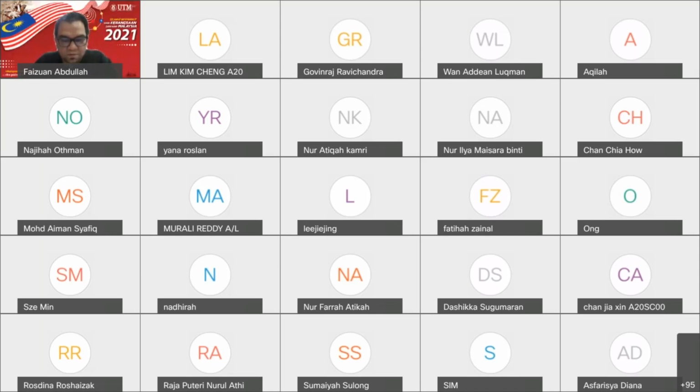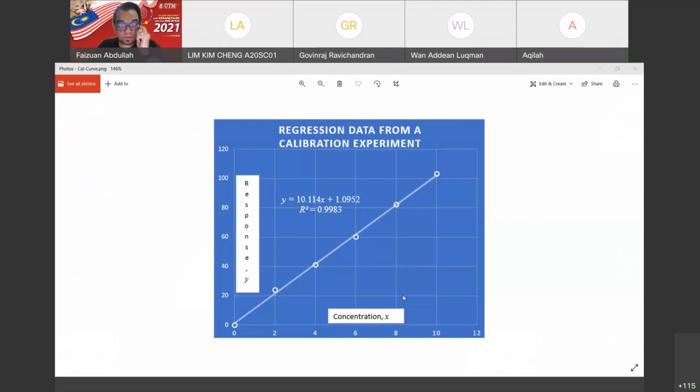All right, guys. Just now we forgot about the standard addition, right? Just now we prepared a series of calibration solutions, the normal calibration, 0.1 to 0.5, let's say. Now, just ignore the amount of concentration, okay? Let's say we have prepared 1, 2, 3, 4, 5.